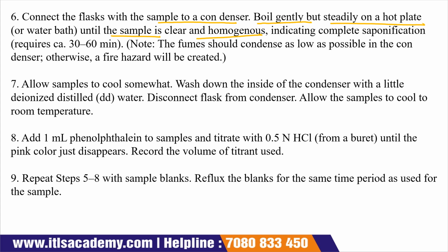We connect this flask to the condenser and boil it until the sample becomes clear or homogeneous, which indicates complete saponification. Complete saponification requires 30 to 60 minutes. Note that the fume should be condensed as low as possible in the condenser, otherwise a fire hazard will be created.